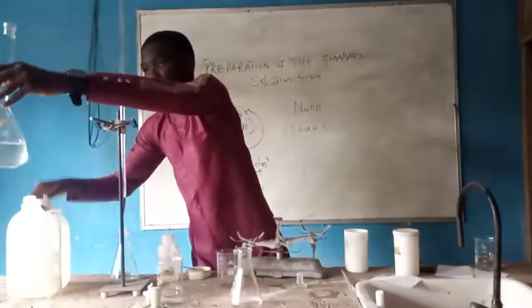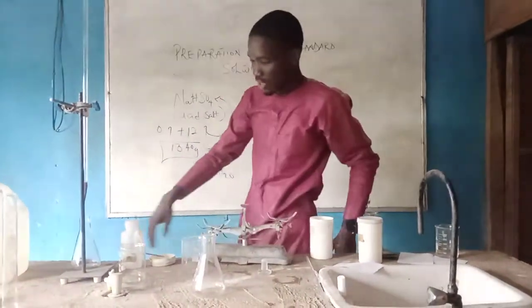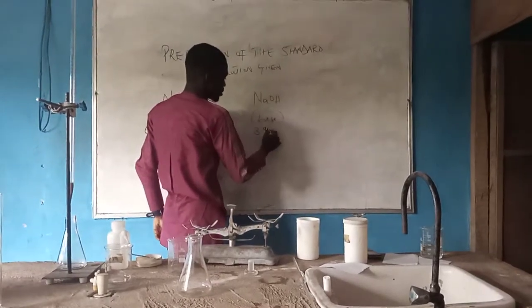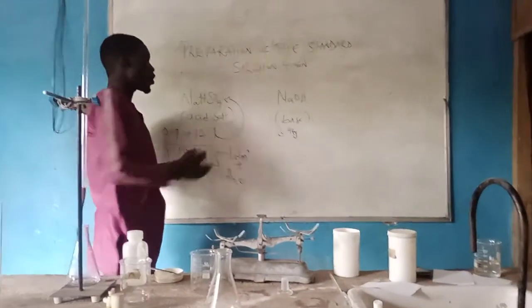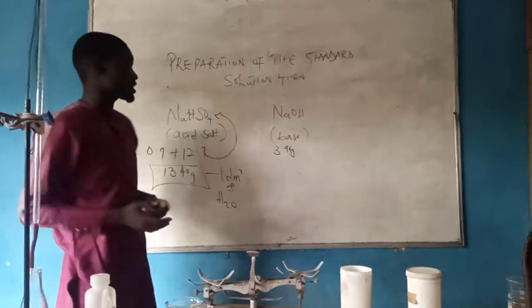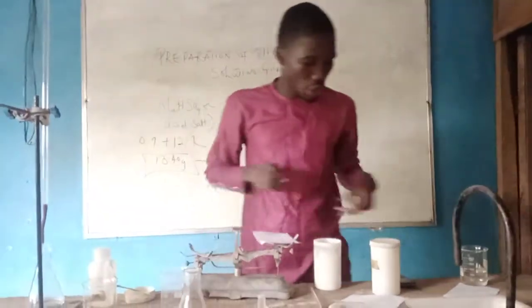So you can do this, you can do that. So fill it up. So now the next thing is we have to calculate for this, which is given to be what? 3.94, if I'm not mistaken, of the particular salt given for sodium hydroxide now. So now, class is telling me that the same way you did for this, you did the same thing for what? Your sodium hydroxide.